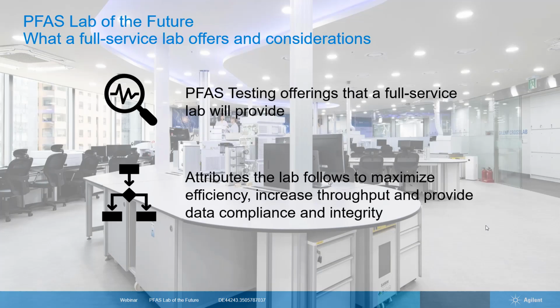So for the remainder of this talk, we're going to talk about this PFAS lab of the future, and I'm going to break down the talk into two things. First, I'm going to talk about what a lab that is offering full service PFAS testing, what are the kinds of testing they will provide. And then secondly, we'll move into what are the attributes that this lab follows to maximize their efficiency, increase throughput, and also provide data compliance and integrity of the highest standards.